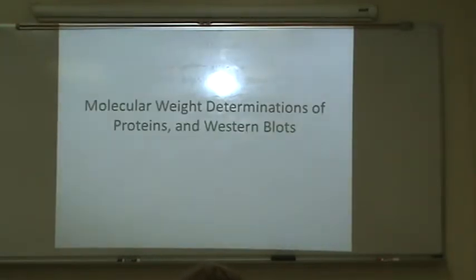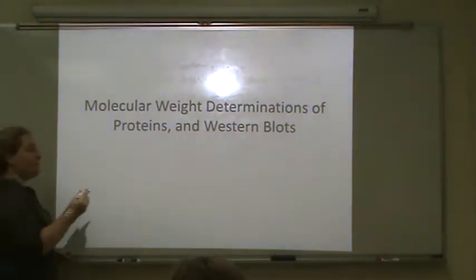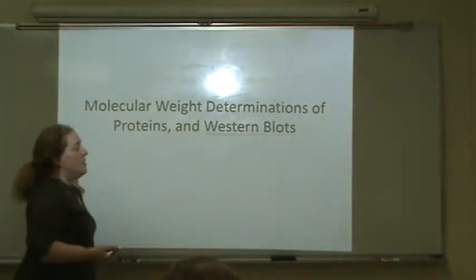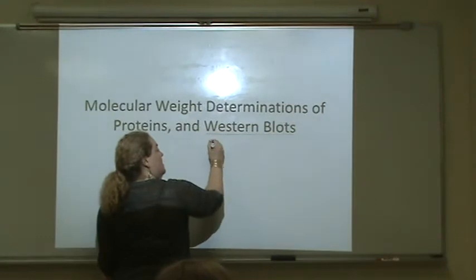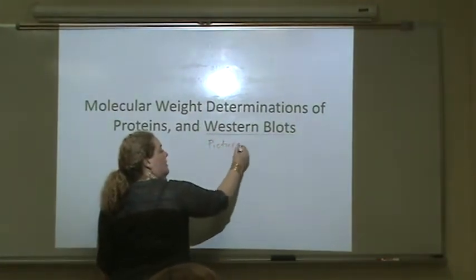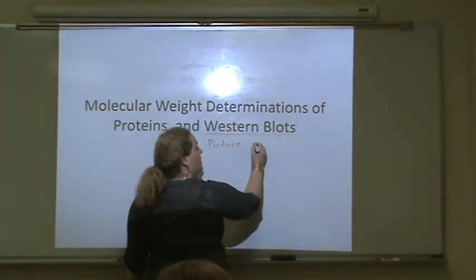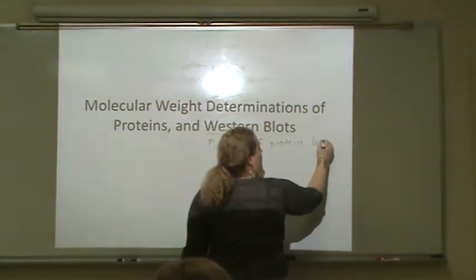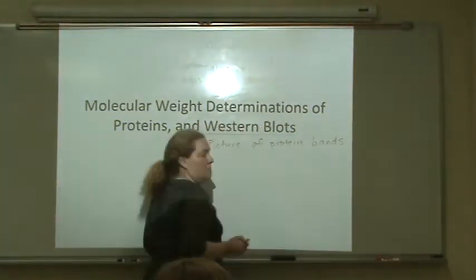So first of all, the first thing I want to talk about is this term Western blot, what it means and where it came from. If you see the term Western blot, you end up with a picture of protein bands.